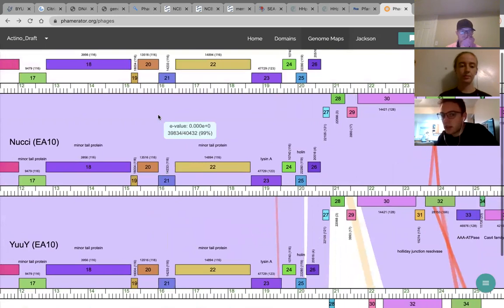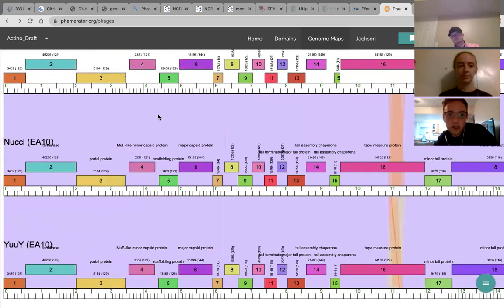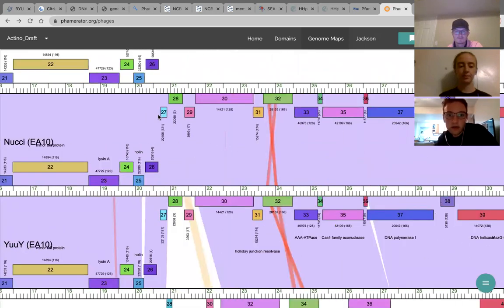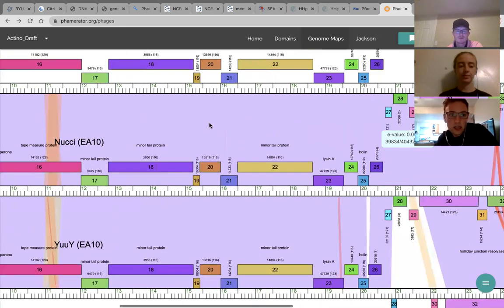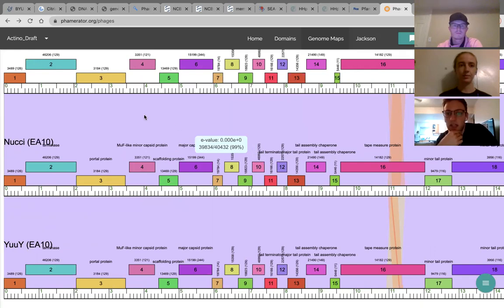You could put that one as well, but for 29, it's not. That should be it for our annotations. Again, use SEA-PHAGES for the most part. The documenting for protein coding genes, that's going to be a huge help throughout this whole process.